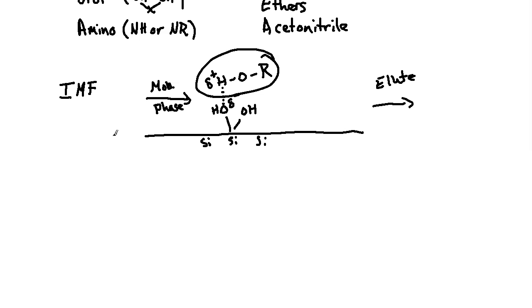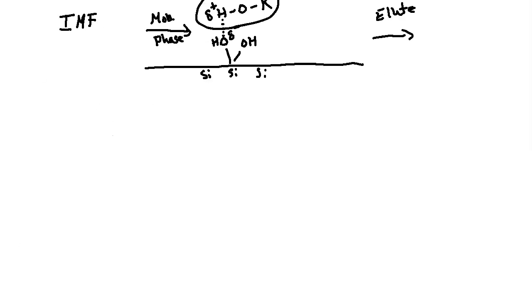When research and development needs to turn to something, usually reverse phase is the favored, and if there's something very polar, then maybe ion separation is utilized in some form. Okay, so when is it appropriate to use normal phase chromatography? Well, it turns out that there could be several scenarios in which this technique is applicable, and that's what we want to take a look at or discuss next here.